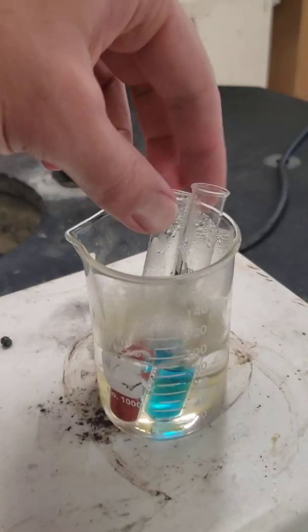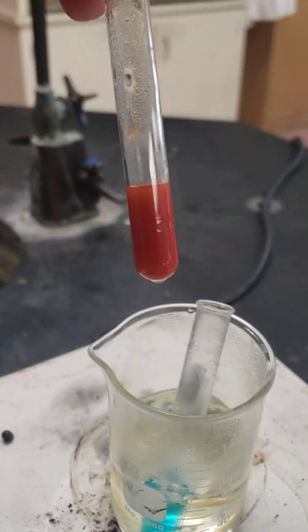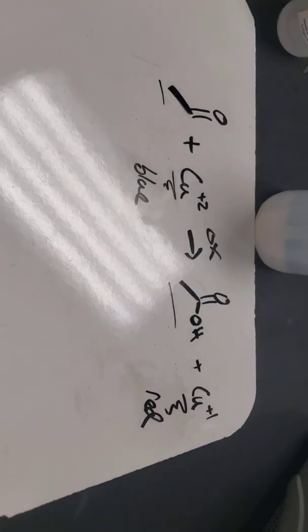Again, it's kind of our final result. We get this bright red versus the blue. And that's the reaction we're talking about.